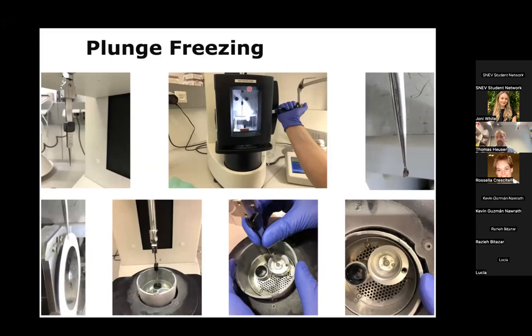The reason why we often use these blotting machines is because they can do this much more reproducibly than a human can. If you ever get a chance to work with this method, this will be the most inefficient way to prepare a sample that you ever use, I can promise you, because you will lose more than 99.98% of your preciously prepared sample. So the large majority of the drop of sample that you applied will just be sucked up in this filter paper and go straight into garbage.